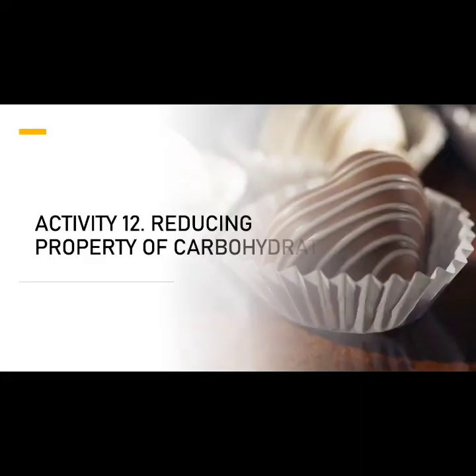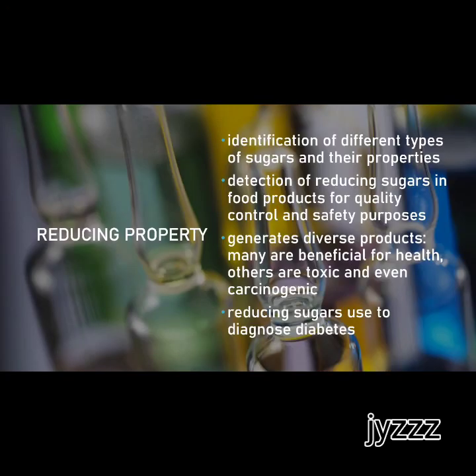We're going to talk about the reducing properties of carbohydrates, which is in Activity 12. Let's take a look at that one. The reducing property of sugar is important for the identification of the different types of sugars and their properties.